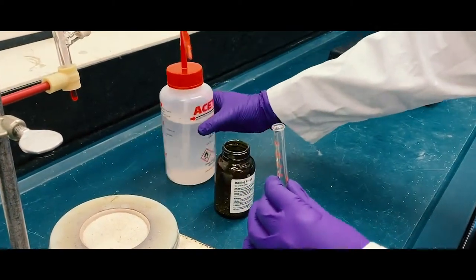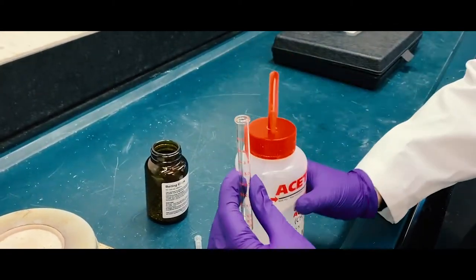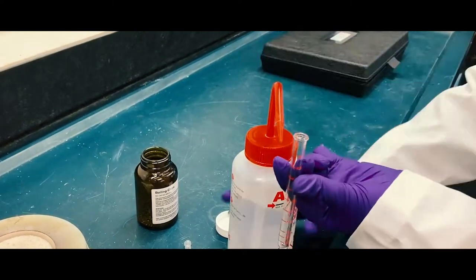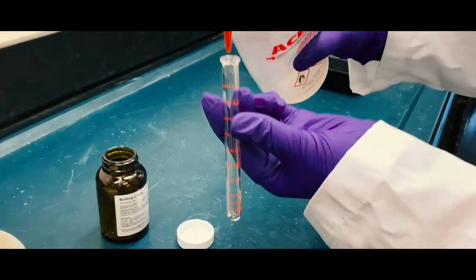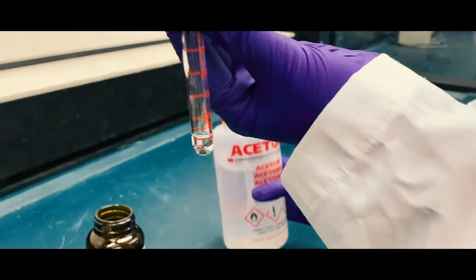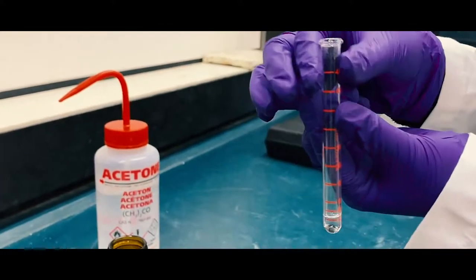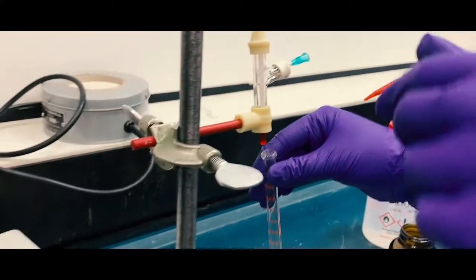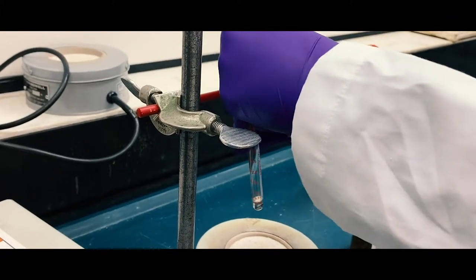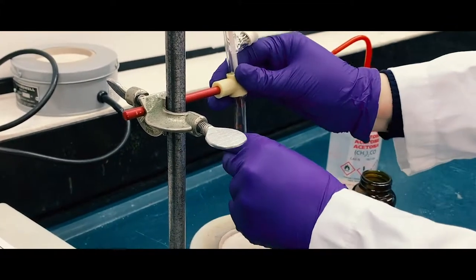Then add about half a milliliter of the liquid, which is acetone. Attach the test tube to the boiling point apparatus.